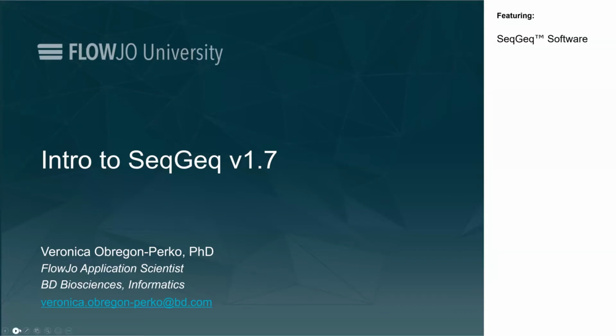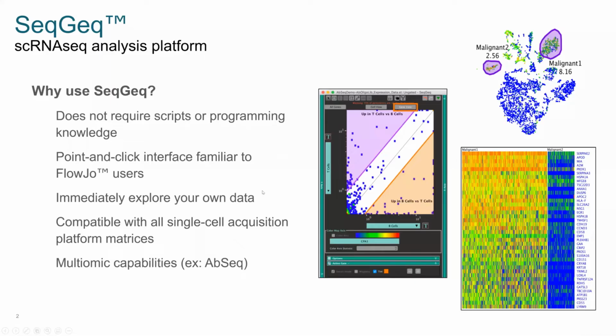With single-cell RNA sequencing, we can get a lot of information, definitely more granularity than we would get with traditional bulk sequencing, and also more depth than we could get with traditional flow cytometry, at least with current technologies. But with single-cell RNA sequencing data comes the task of having to get in there and get meaningful information out of it.